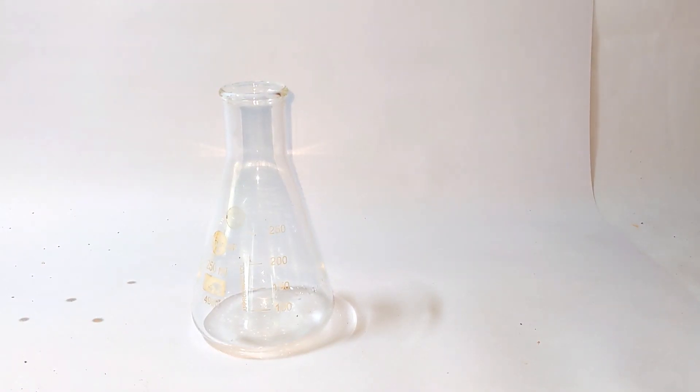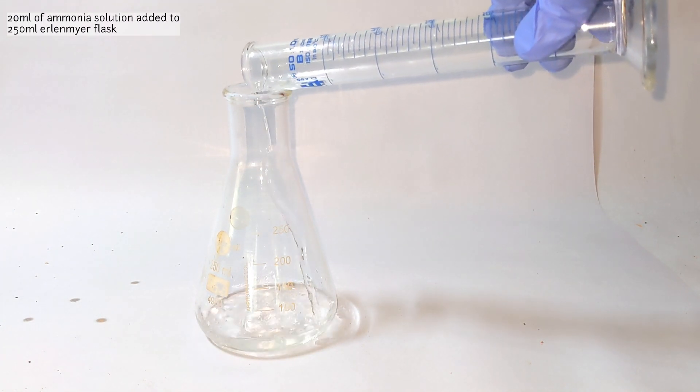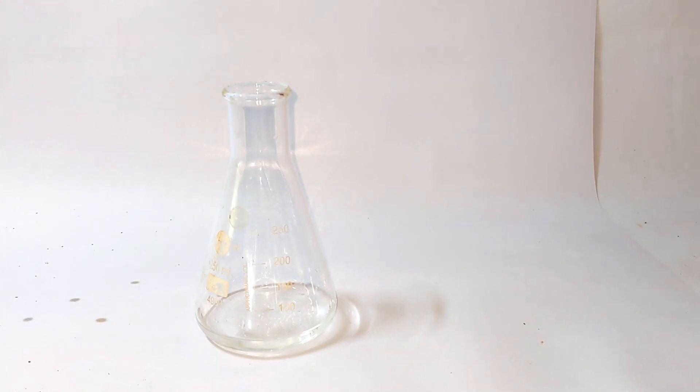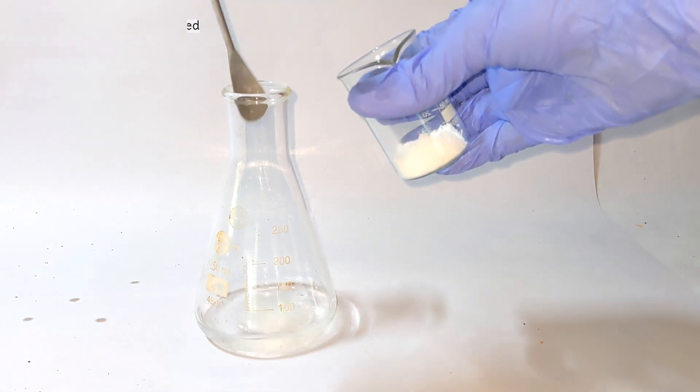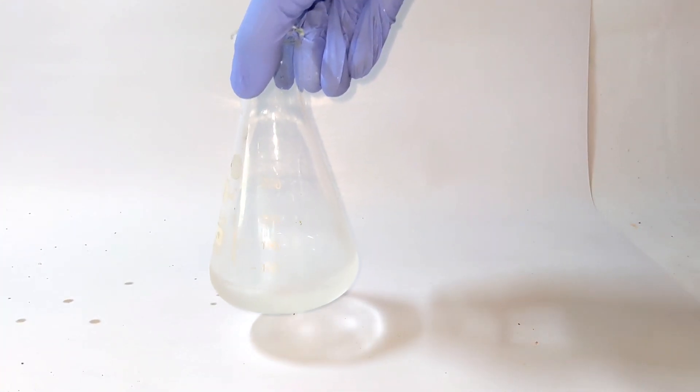A 250 milliliter Erlenmeyer flask was taken and then 20 milliliters of concentrated ammonia solution of specific gravity 0.91 is added. Then 5 grams of pre-weighed ammonium chloride crystals were added to the ammonia solution. The flask was then shaken continuously until all the crystals dissolve, which might take a minute or so.